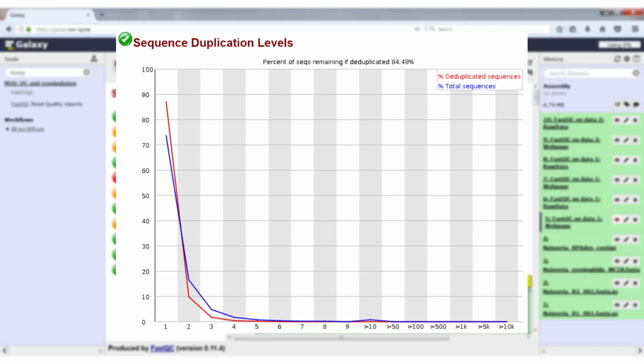So if you see that the graph is high on the right side, or if you see any spikes on the right, this indicates an enrichment bias. Do keep in mind though that the binning size is different towards the right, so it's normal to see small bumps, as these are the result of differences in bin sizes.